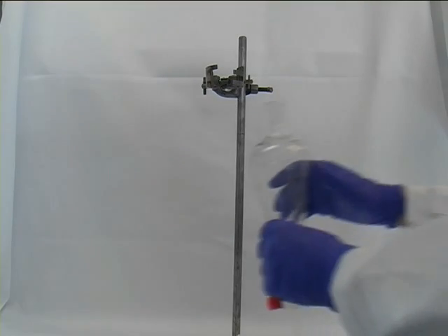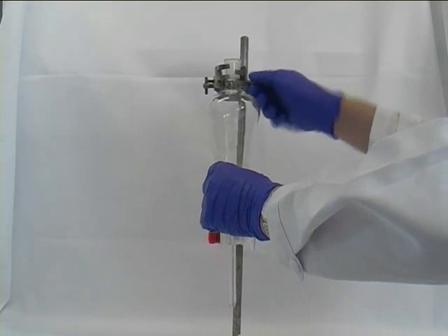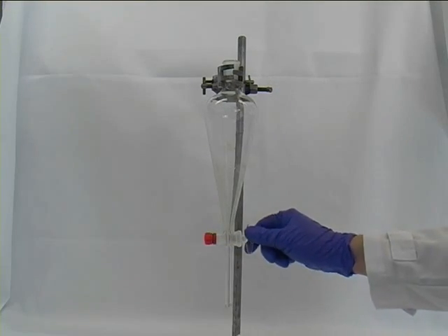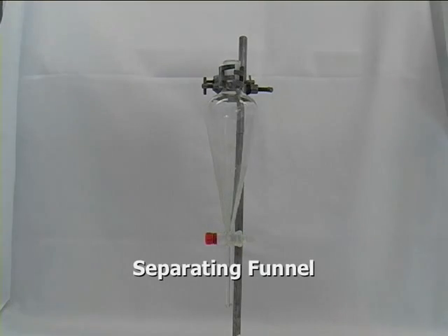First thing is to clamp the separatory funnel firmly into a retort stand and make sure that the tap at the bottom is closed in order not to lose any solvent.